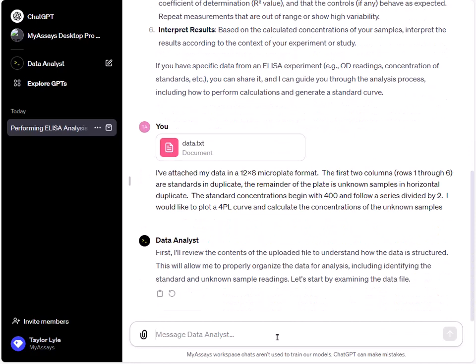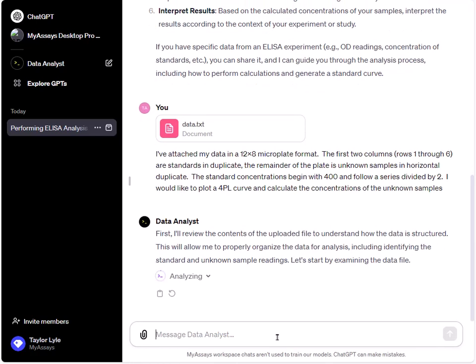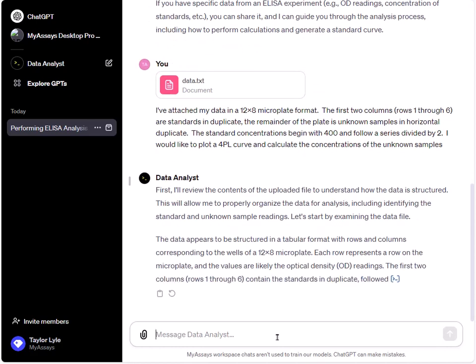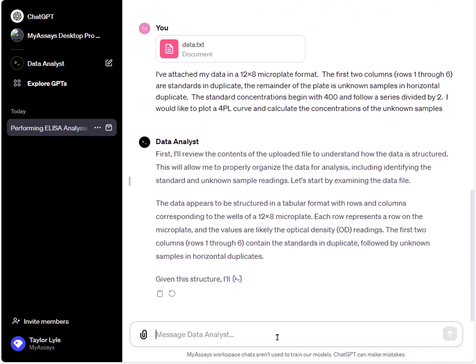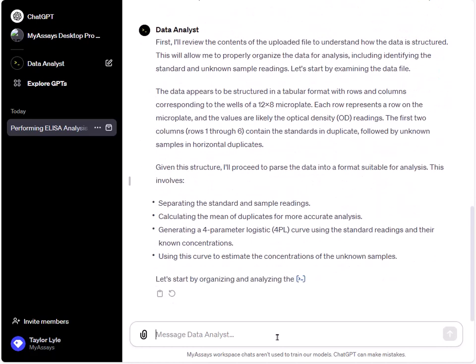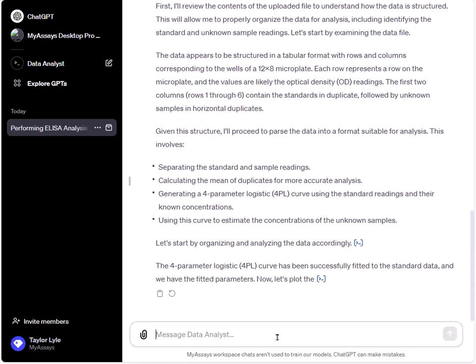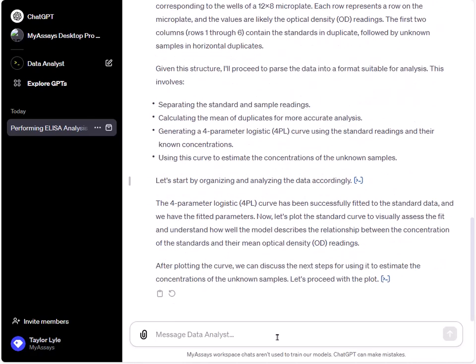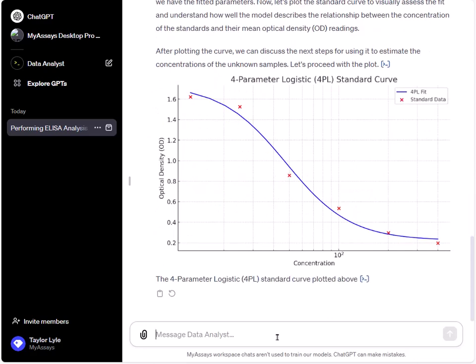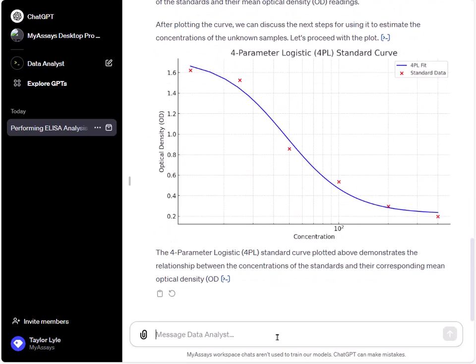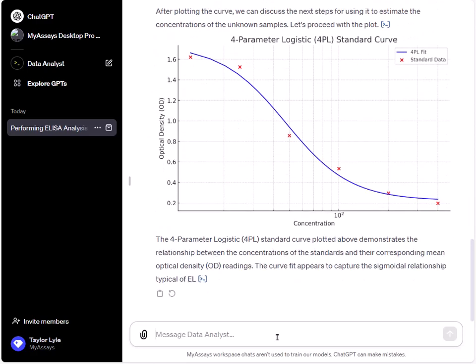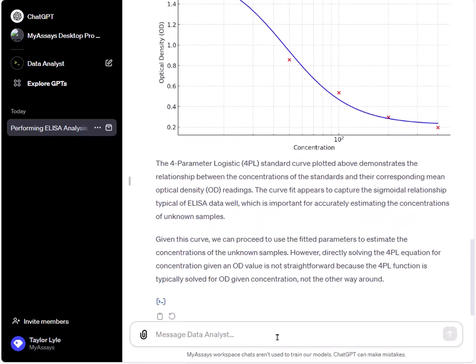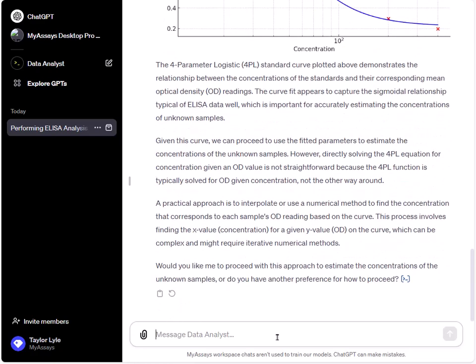ChatGPT will now perform a 4PL fit and provide a summary of the calculations performed. Here we can see our 4PL fit and I'll advise to proceed with the analysis.